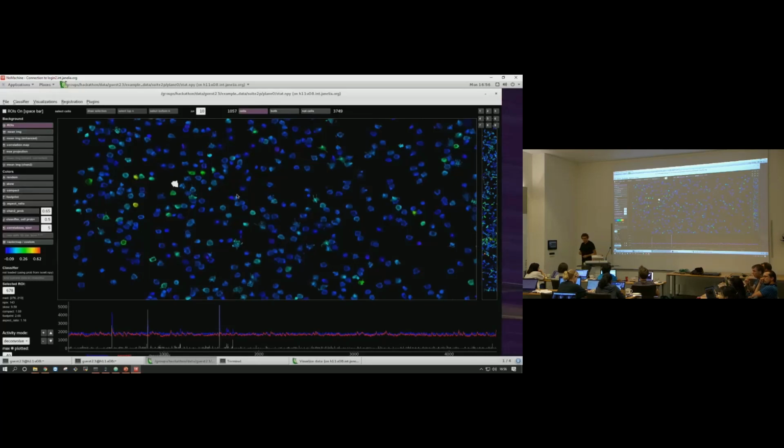Yeah. Some cell types have a permissive internal store of calcium in response to calcium intake. It would also show as a huge spike here. That's a good question. I think that whole process is a lot smaller than the influx of calcium you get from a spike. Unless, I don't know, maybe there are some cell types that are very different from that, but that's my understanding. Most of these really big transients will correspond to spikes. Some of the small transients might be like what you're saying.